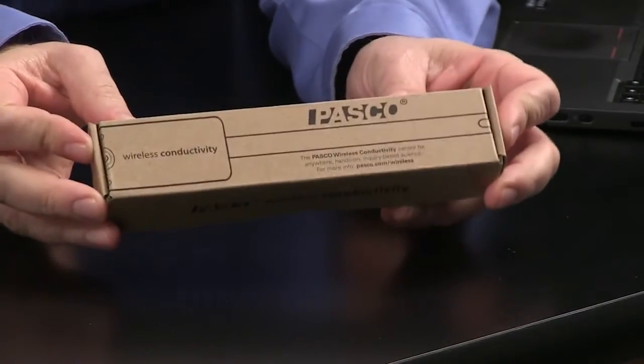Hi, I'm Tom Moschiavo, Education Manager here at PASCO Scientific. And I'm Barbara Puglisi, Curriculum and Training Specialist at PASCO. And we are here today to talk about the Wireless Conductivity Sensor.